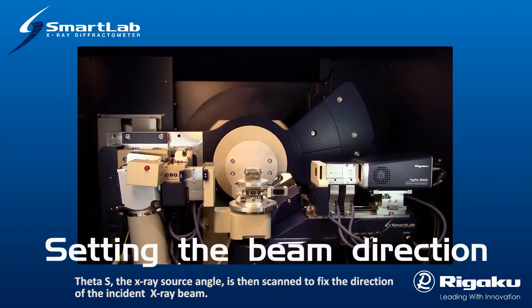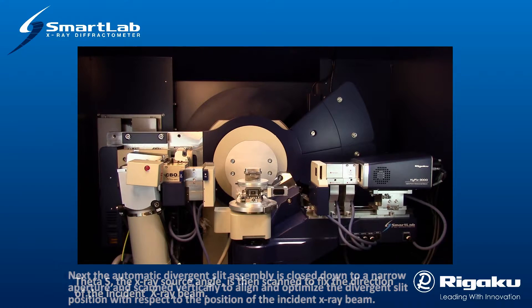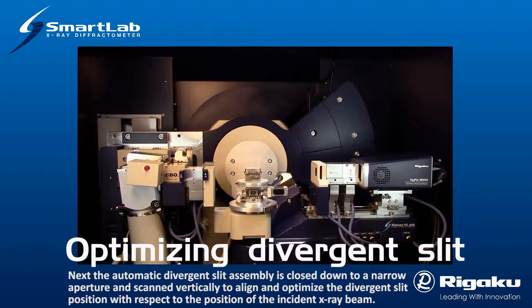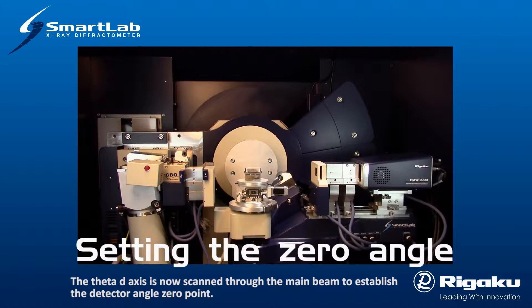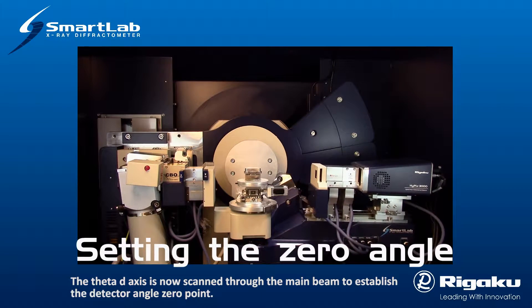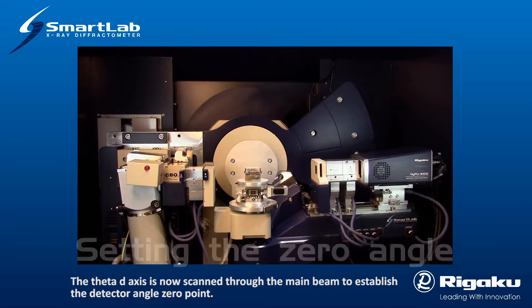Theta-S, the X-ray source angle, is then scanned to fix the direction of the incident X-ray beam. Next, the automatic divergent slit assembly is closed down to a narrow aperture and scanned vertically to align and optimize the divergent slit position with respect to the position of the incident X-ray beam. The theta-D axis is then scanned through the main beam to establish the detector angle zero point.